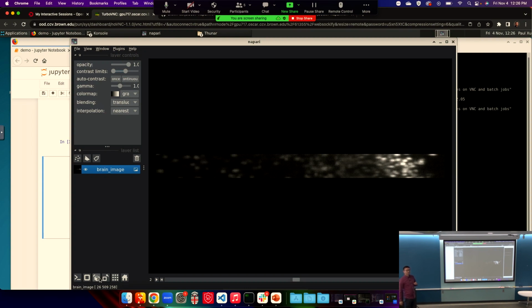Is there something else going on here for it to know how to do the stacking? From what I understand, it does the interpolation right here, and you can see this right here. You can choose different ways of, I think that's how they glue together the z-axis. It does the interpolation, and you can use different algorithms to do the interpolation as well. That's how I understand it. I'm not sure. I could be totally wrong.